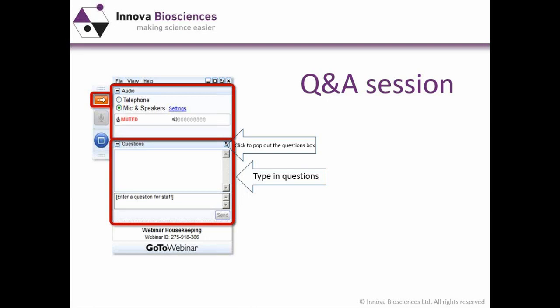Our next question is, do you have to do covalent conjugation at different pH values? No, you don't. It seems to be very different from the passive method. All reactions are done using exactly the same conditions. The only variable is how much antibody you add. But we provide advice with the kit. It's fairly predictable. Generally, you just try 3 amounts.